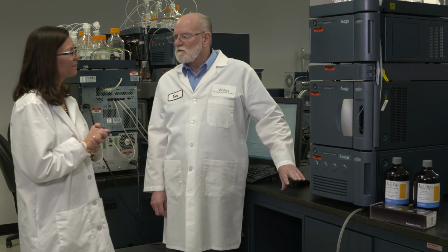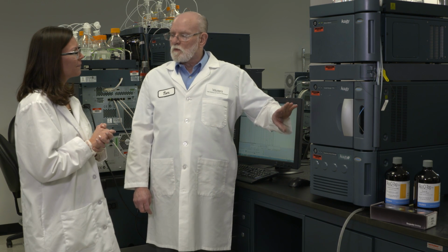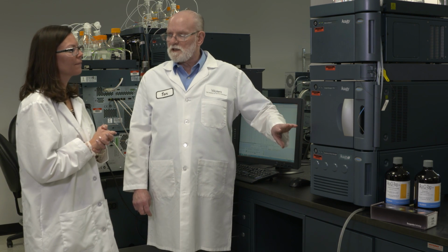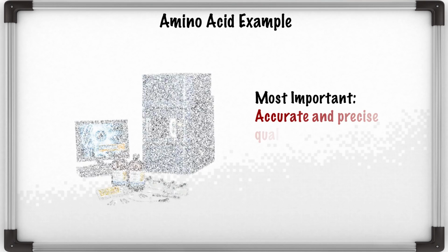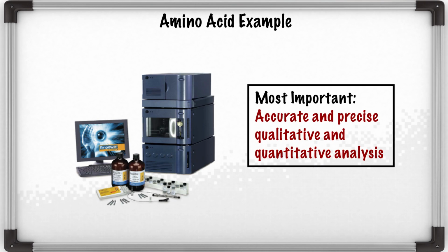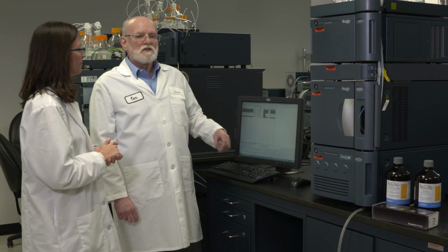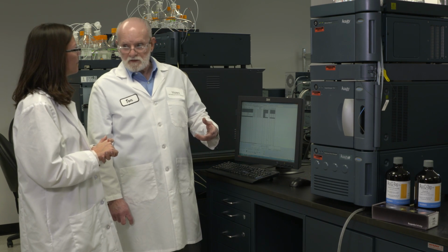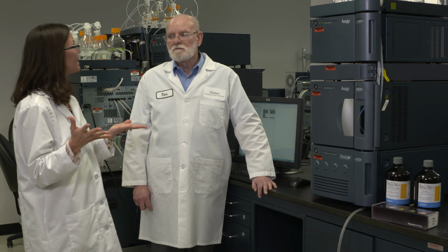The important thing for our users is that we put the whole thing together in a way that we test so that we know that it will work for their application. We provide the column and the eluents for doing the separation, all of the methods to actually run the sample, and that's all brought together in the software to actually execute the method. So just like in music, if you're well trained, you can make it look really easy.